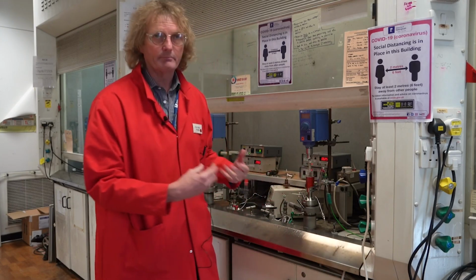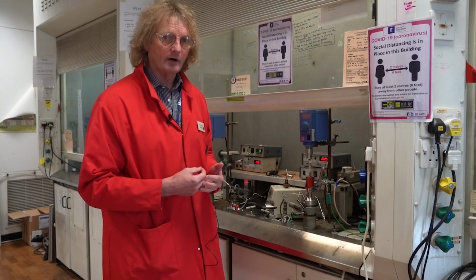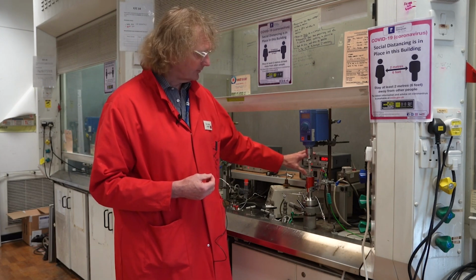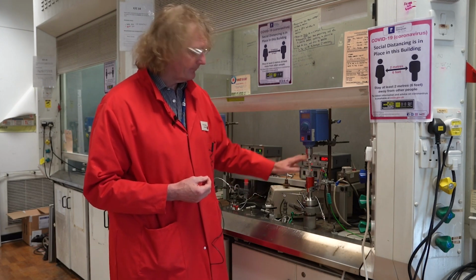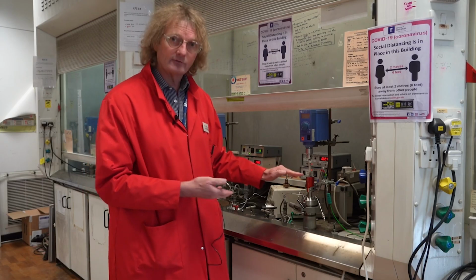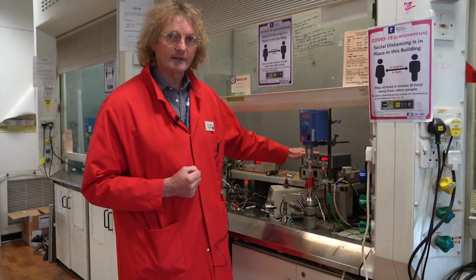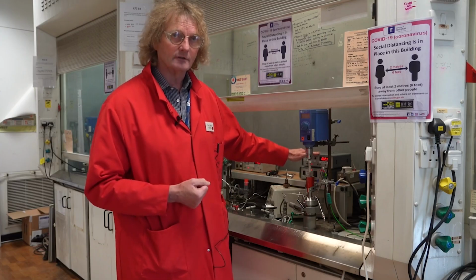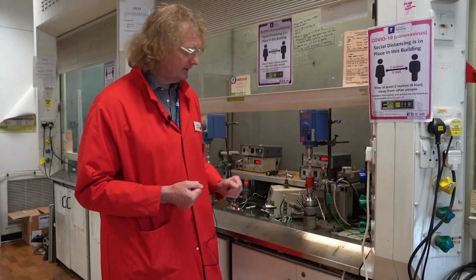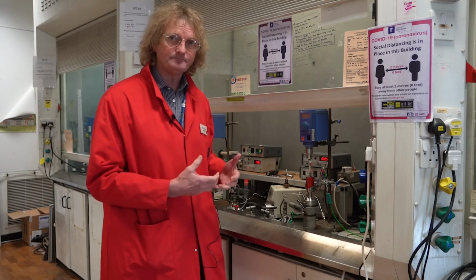If something went wrong and the pressure rose higher than we wanted it to, then the whole thing would cut off. We've got electronic control here as well, so we're controlling temperature and pressure, and actually also if the pressure in our reaction gets too high, then this little box here will instantly shut off the heating and shut down the reaction. So there's an electronic cut-off as well. So from a safety perspective, that's how we build things in.